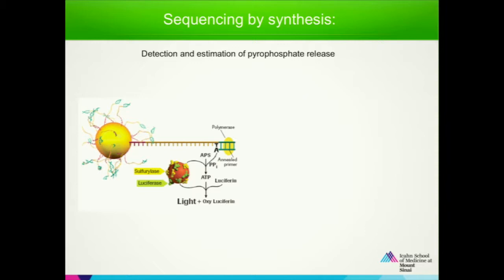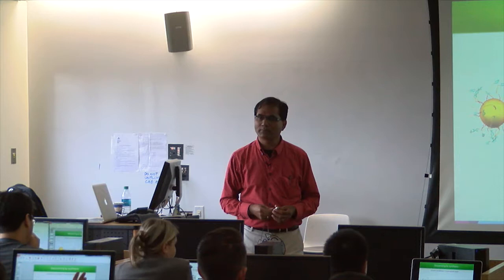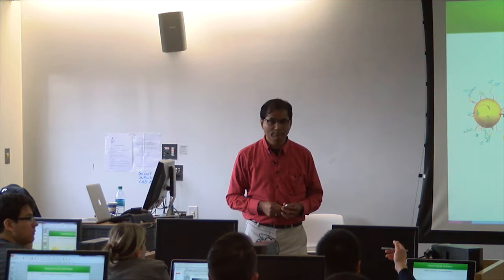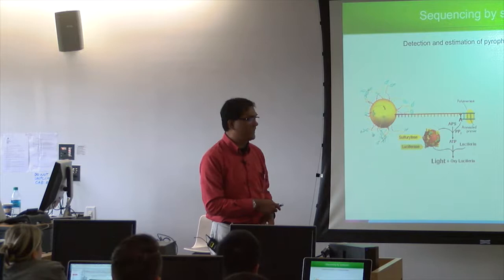So did they wash one of the substrates, remove it, wash on another substrate? Keep adding one by one, yes. So they have to do four cycles basically? No, ATGC. You can add ATGC, ATGC every time. Right, so you have to do four cycles per base pair position. No, one cycle per base pair. Nucleotide, go cycles, you know, A, T, G, C, A, T, G, C, or G, A, T, C, or C, G, A, T, whatever. See, one cycle, you are adding only A to detect only addition of A, exactly.